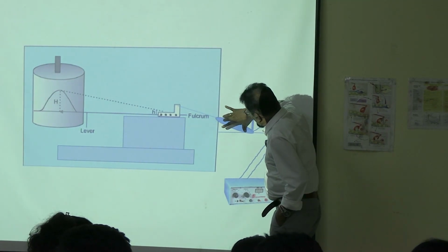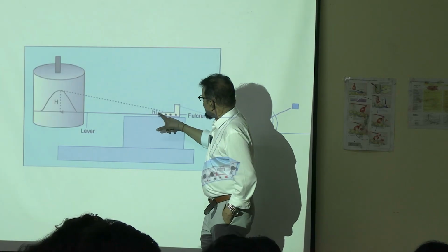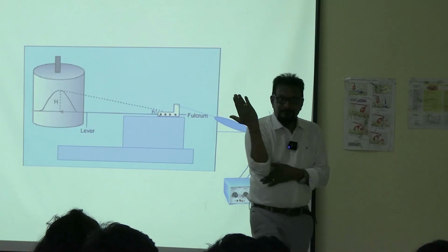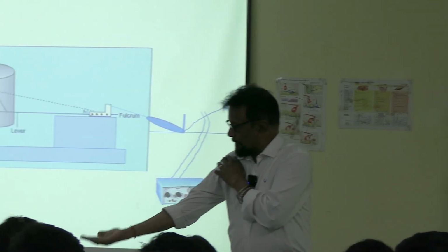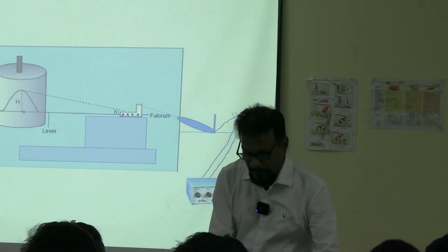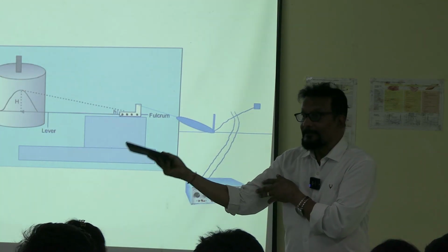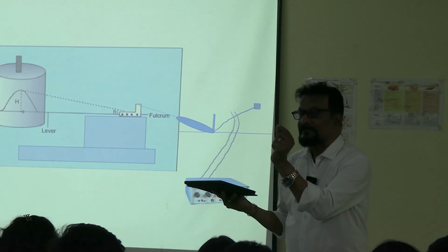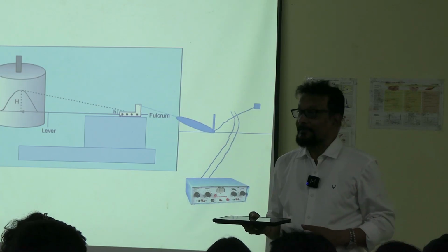This muscle, when it is contracted, this weight has to be lifted. I am lifting my hand. Easily I can do it. Now if I place some weight, then the process will be slightly delayed because of this weight.